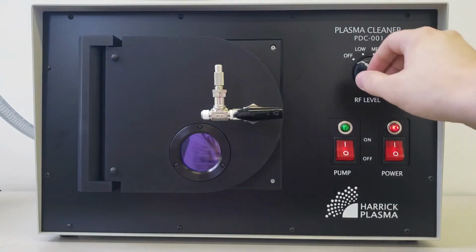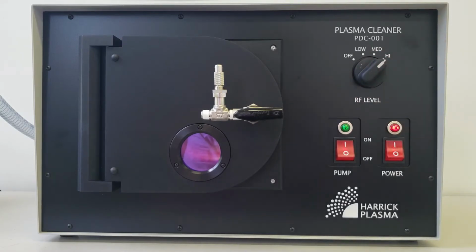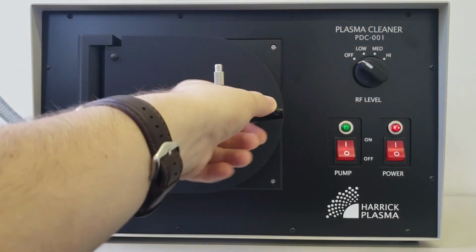Air plasma can vary in form from violet-purple at low pressures to purple-pink at higher pressures. Near the upper pressure limit of 2000 millitorr, the plasma intensity decreases and becomes violet color again. Without a vacuum gauge in your system, you will not know whether or not you are in the proper vacuum range to form plasma.